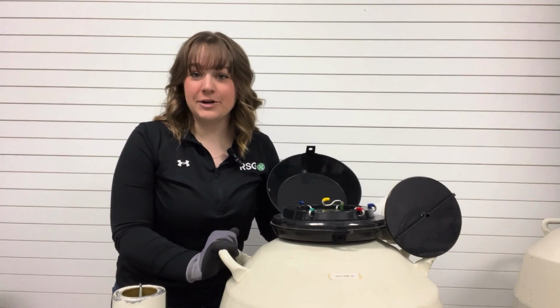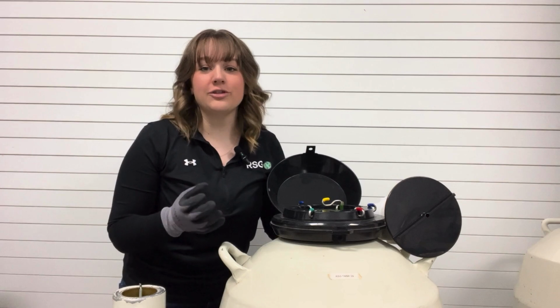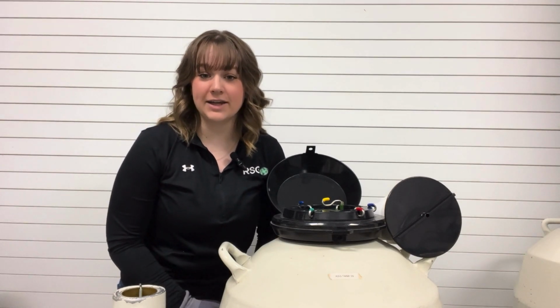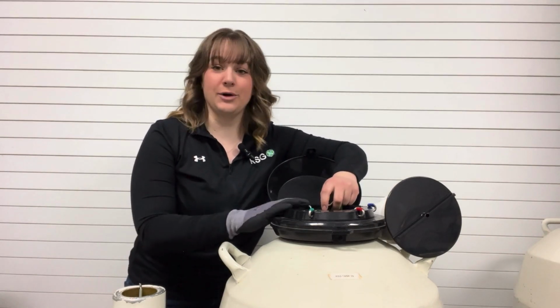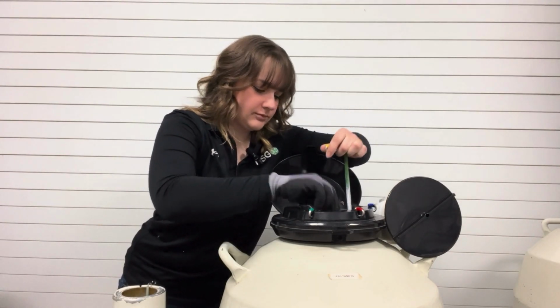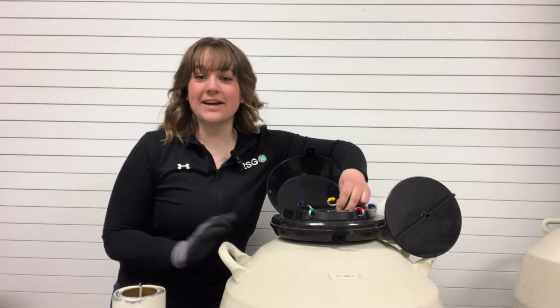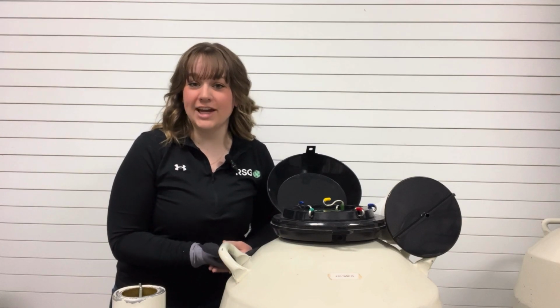You're also going to want to remember to grab the cane by just the tab, or the top portion of it. You don't want to touch the straws or the goblets with your hand, as your hand is a lot warmer than the frozen environment that the genetics have been kept in. We're going to lift up our canister, grab the tab, and transfer our semen from our holding tank into our shipper tank. Be sure to put the canister that you're pulling from back down in the nitrogen as quickly as possible. We don't want to expose the semen that's left in the canister to the air for any longer than it needs to be.